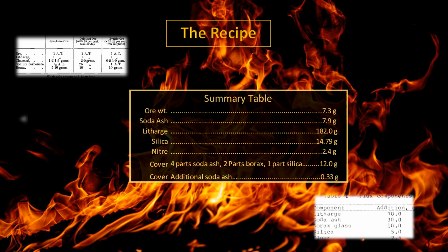By using the charge table and calculating your charges, your results will be more accurate than just using some recipe from YouTube. The summary table shows what would be required to fuse an ideal slag and create the required button containing all the precious and noble metals that would have been trapped in the matrix of the ore used in this case example.